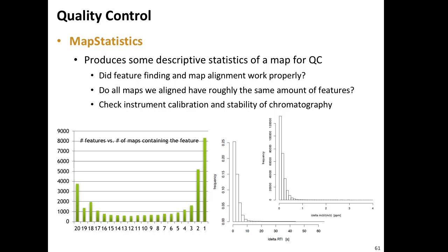These are low intensity features that are close to the level of detection for the feature finding. And they basically pop in and pop out. Now you can change the parameters. You can make your feature finding less sensitive. Then there will be fewer. They will not disappear, though. And you can argue at length, are these guys false positives? When you look at them, you will see, no, there is signal there. And are they what you're interested in? Probably not. Because if you see them only in one map, then you cannot really quantify them.